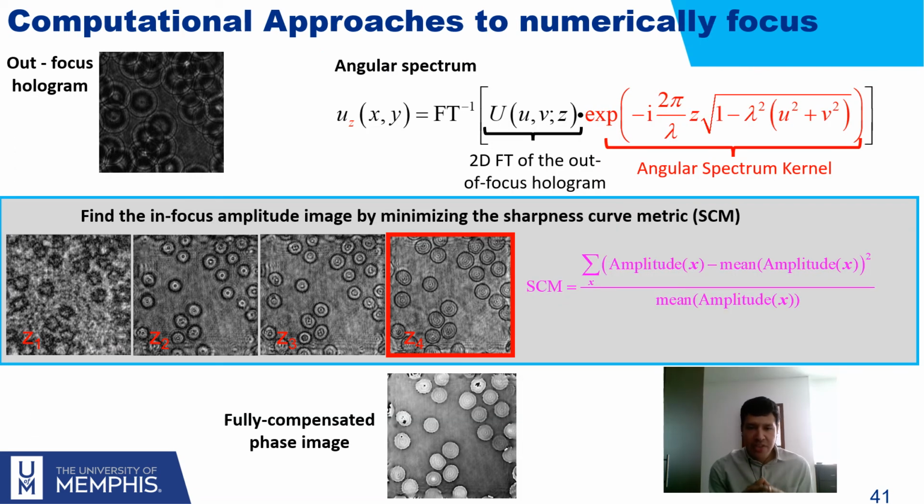So up to now, we have discussed how to process DHM holograms that are acquired in an image plane setup. But what happens when the object does not fulfill this condition, or the camera does not fulfill this condition? Well, we need to propagate. We need to numerically propagate the wave field to obtain a truly in-focus image.